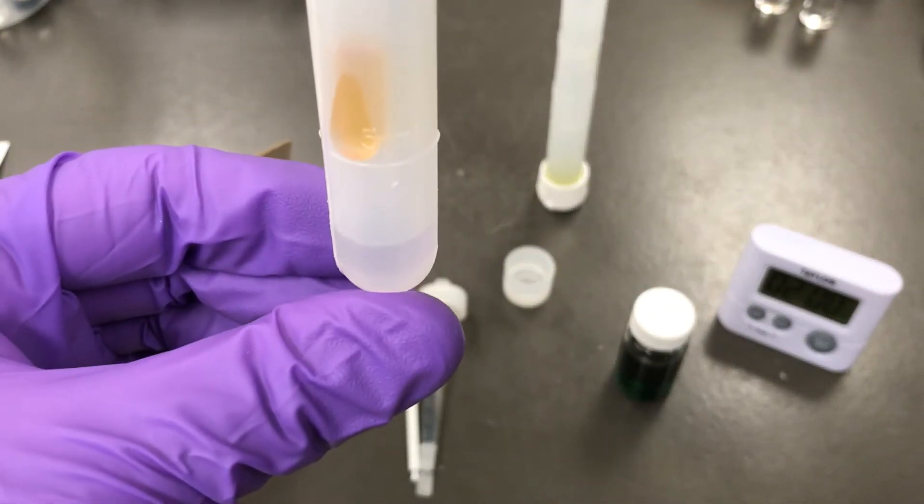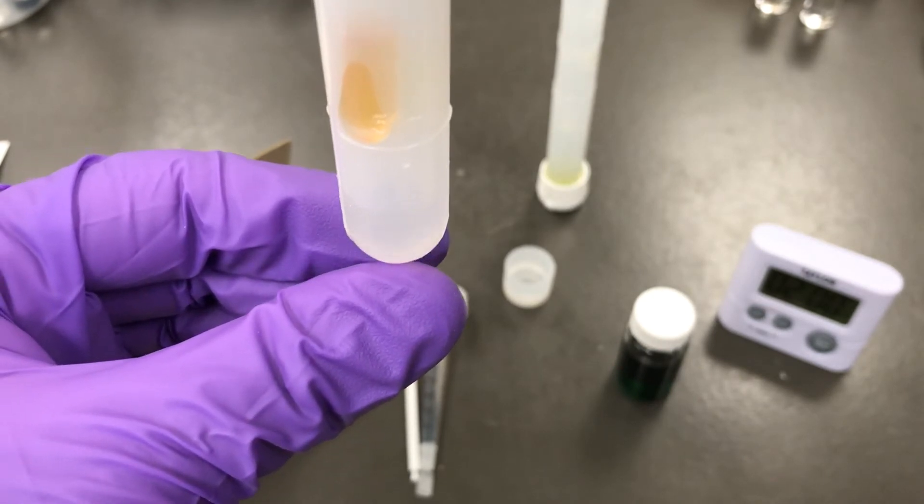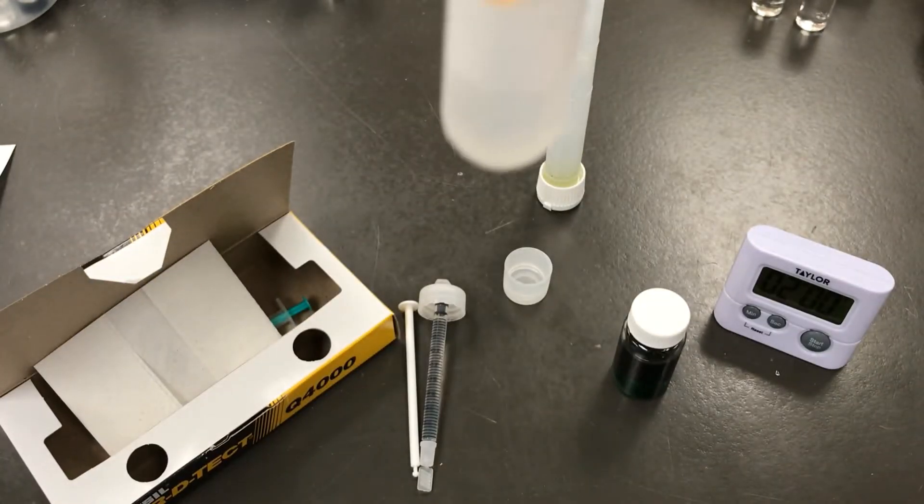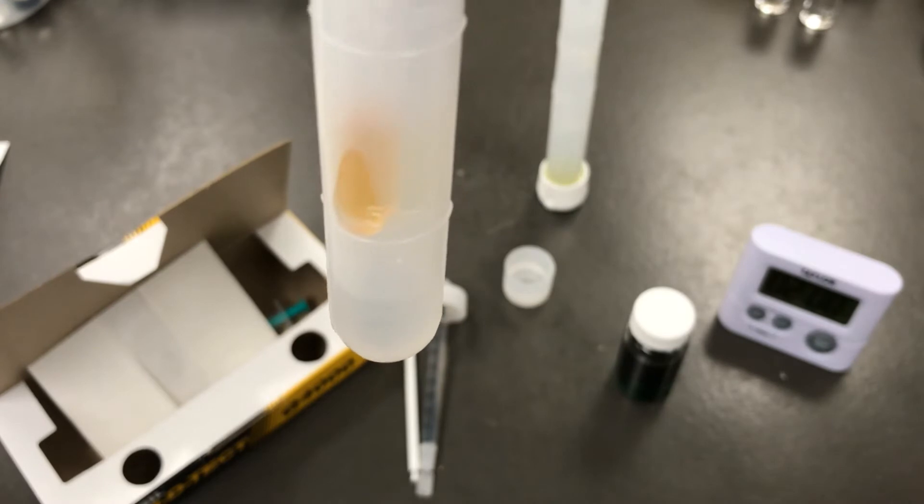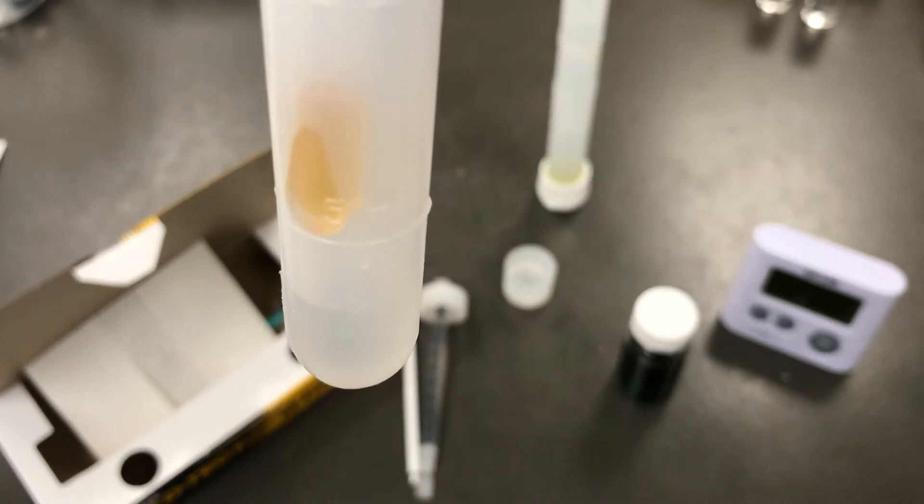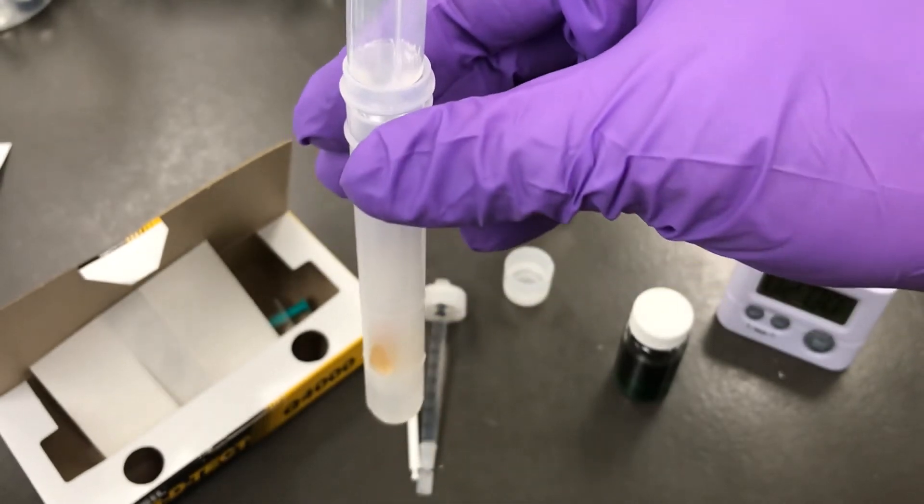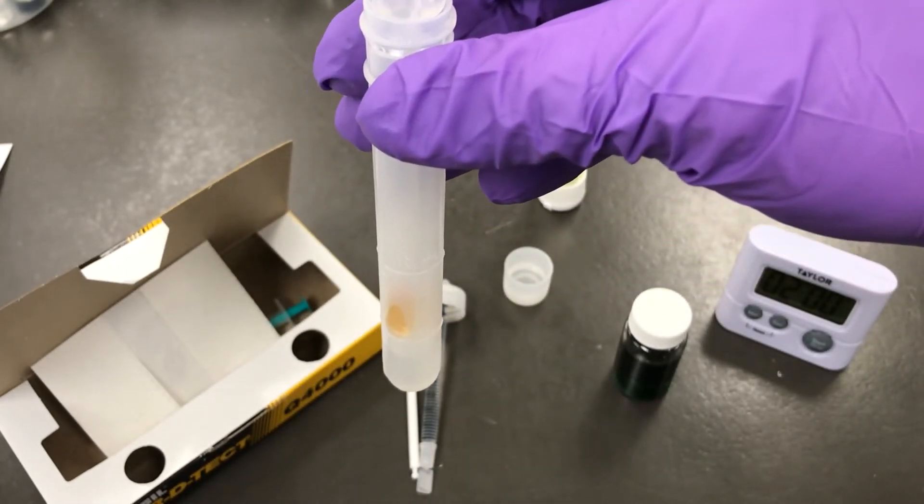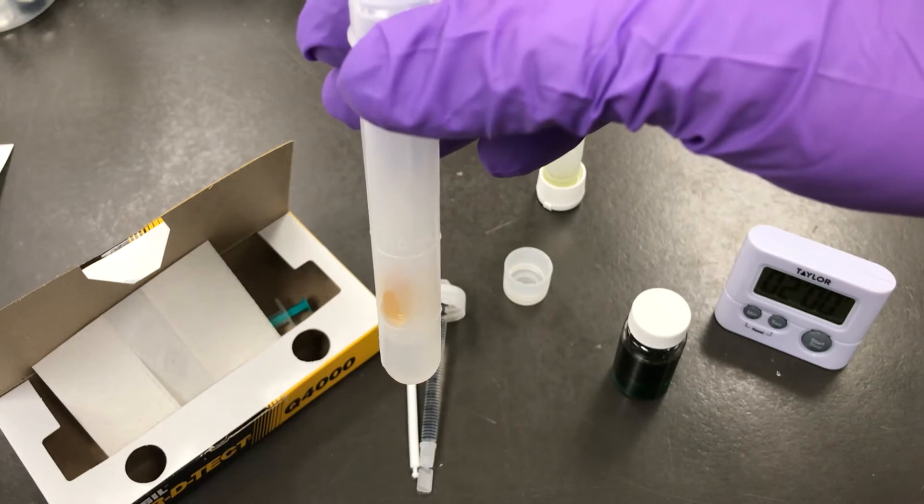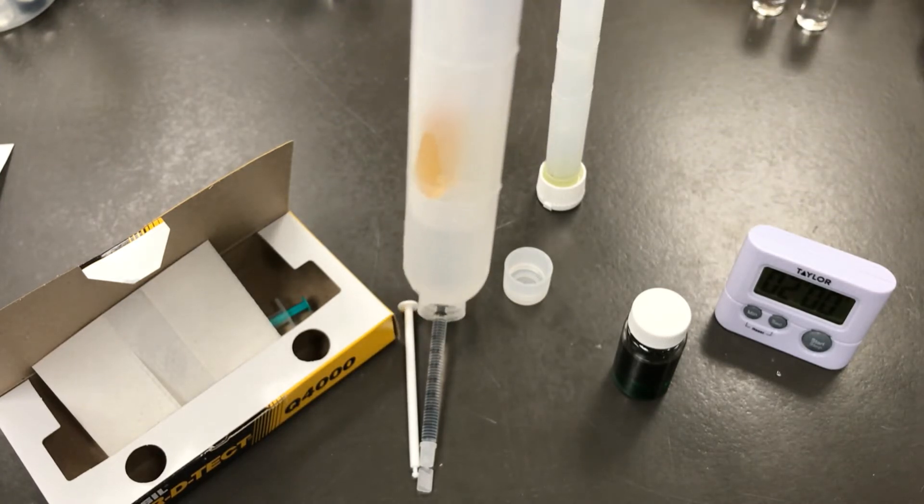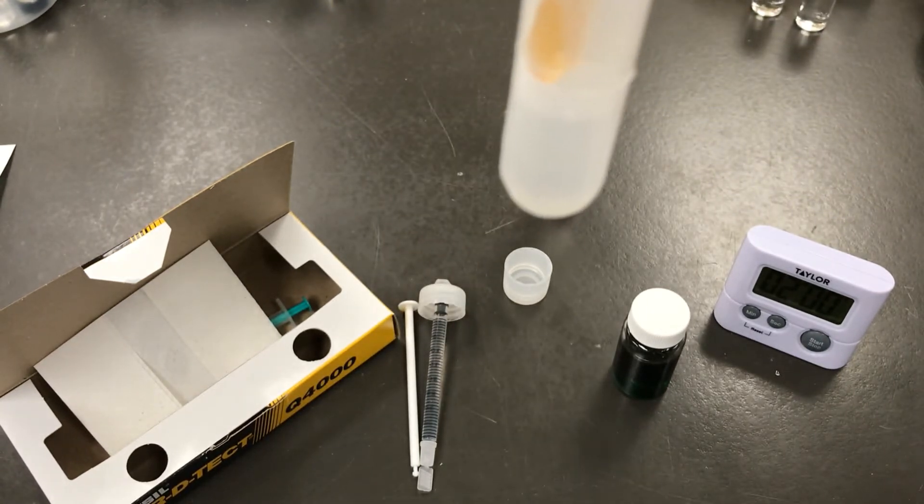And you're going to allow that liquid to filter through the funnel until the tube is filled up to the 5 milliliter line that's embossed on the side. It's important not to try to hurry this step either. You don't want to squeeze the funnel or try to push the liquid through faster than its natural speed. Just allow it to filter at its own pace.